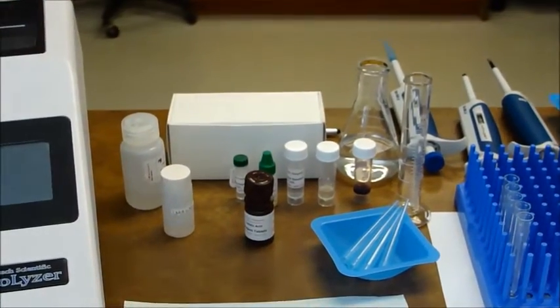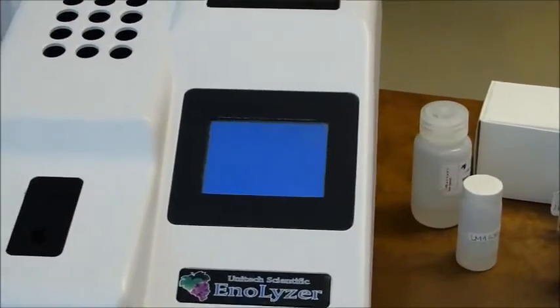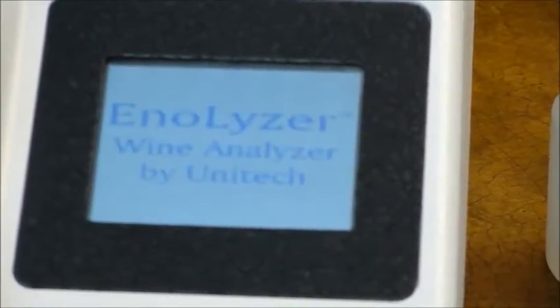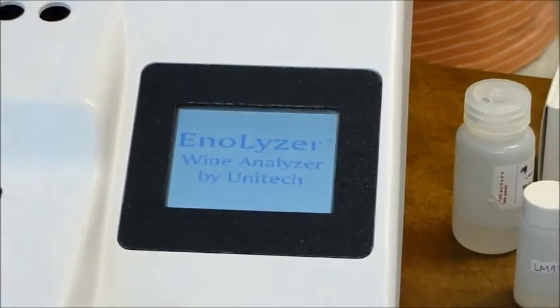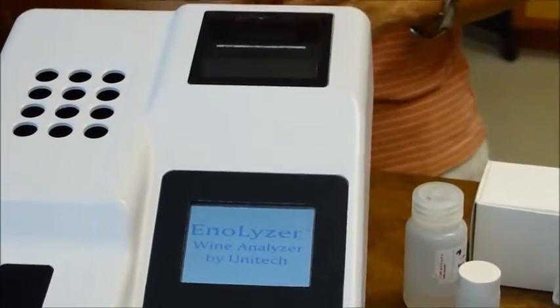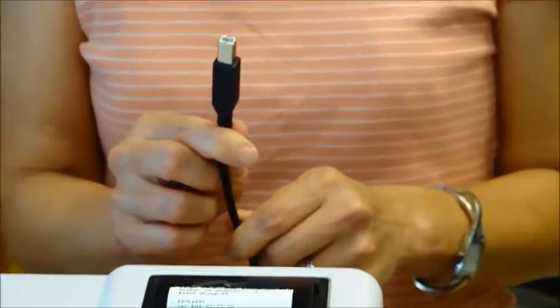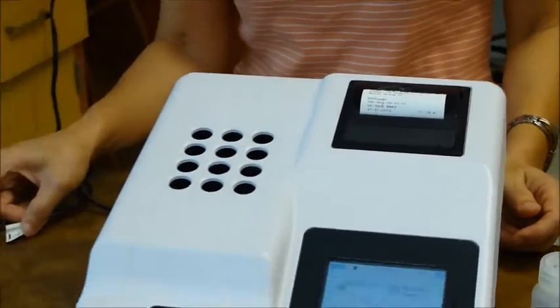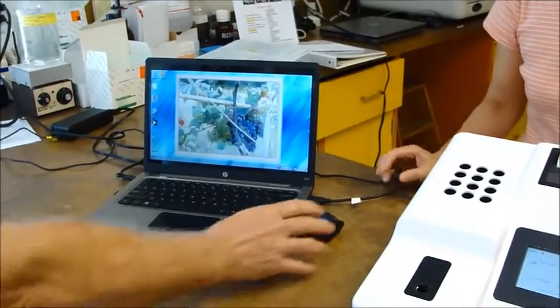With the reagents prepared, we're going to turn on the analyzer power and look at the startup screen. Since we're capturing data on our PC today, we'll connect the printer cable to the back of the analyzer. The other end — the USB end — is inserted into our PC. Now we open the StatFax Capture software on our PC.